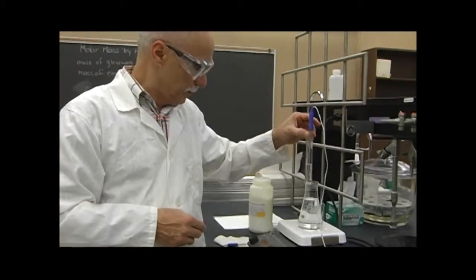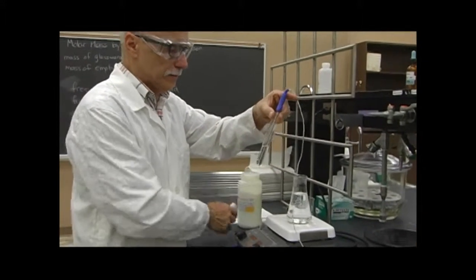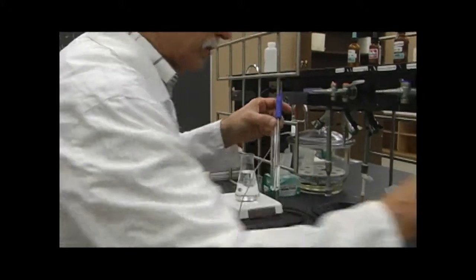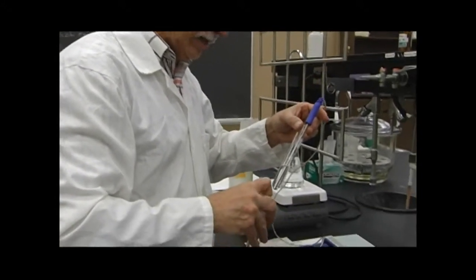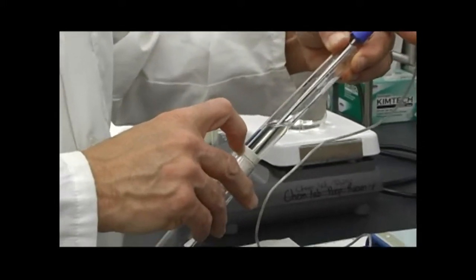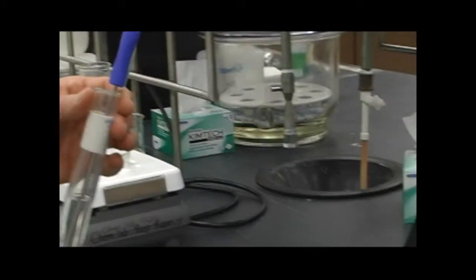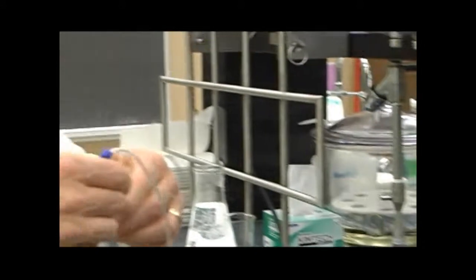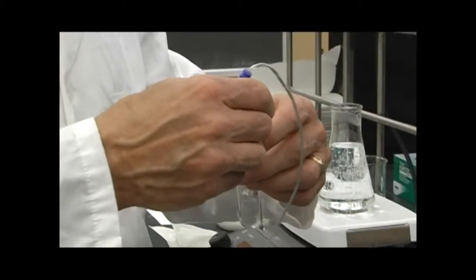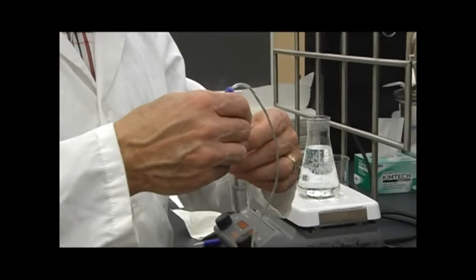Okay, we have put the unknown in the melted lauric acid, and we'll put this smaller test tube into the cooling jacket. And we will start the computer. And we will do the same technique.